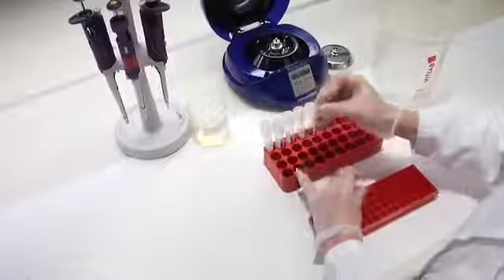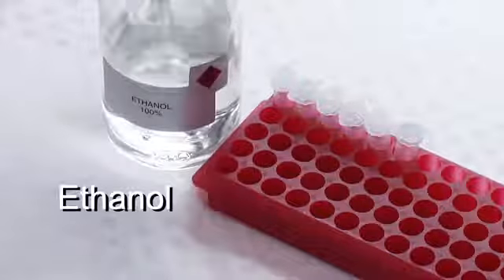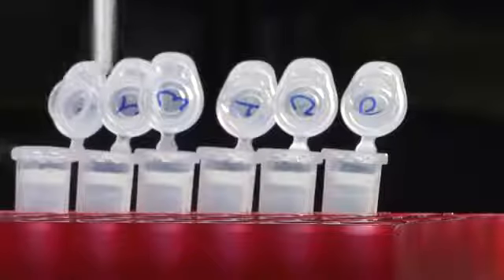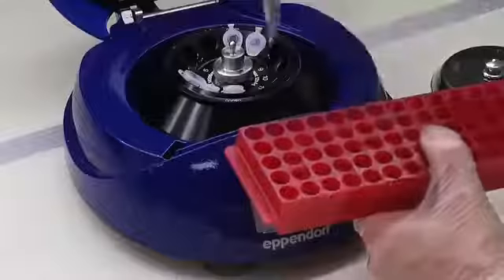And now we need to separate the plasmid from all the leftover chemicals, and we'll do that by adding ethanol. Nucleic acids are insoluble in ethanol, so the plasmid will precipitate when we centrifuge it again.